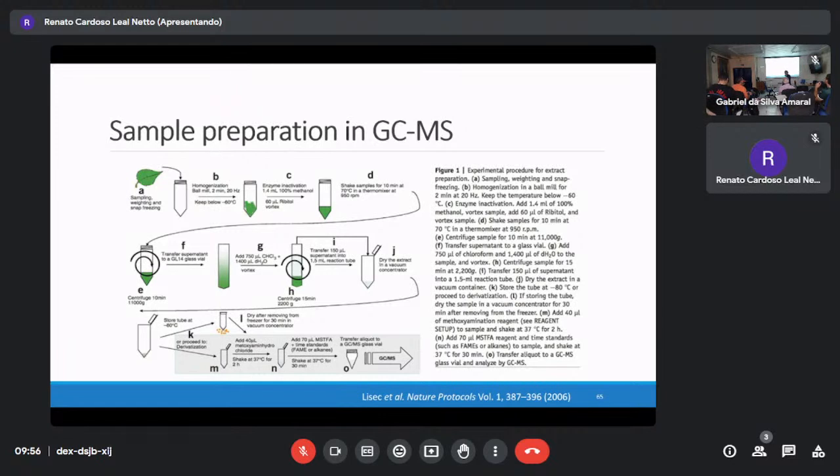Also, age is not only the plant age, another important one is the developmental stage. In the same plant material, upper leaf and lower leaf, I did a lot of experiments. This is completely different. Sure, you might get upper leaves, medium leaves, and bottom leaves, different ages, and homogenize everything. That's the solution. Go for it.